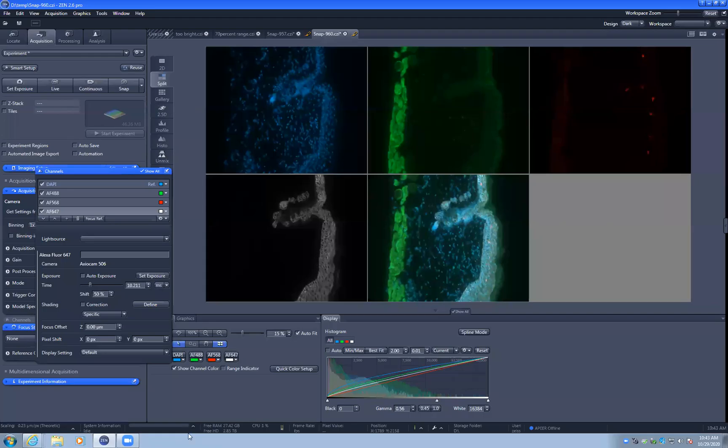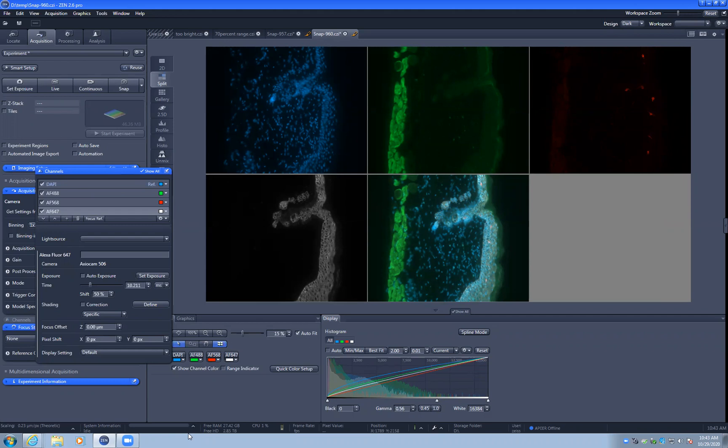This video discusses how to set exposure times with wide-field fluorescent microscopy for a wide dynamic range with no saturation. The problem with saturation would be a different video or webpage.